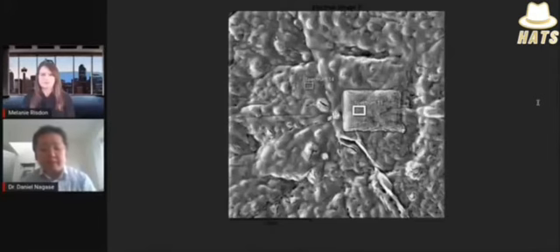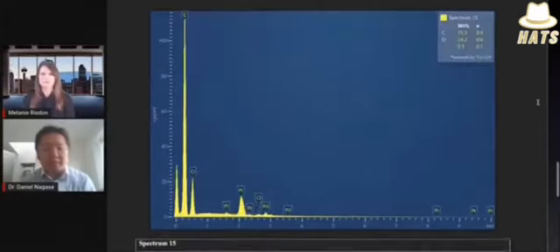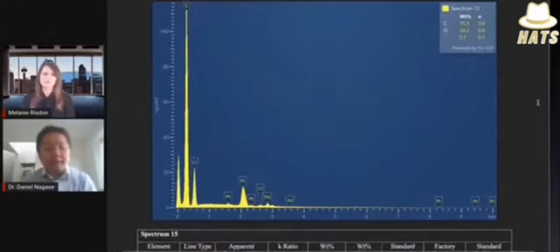Now we'll get to the thing that looks like a little computer chip with all sorts of dots in it. And that's where we have carbon and oxygen again, platinum, palladium, and a little bit of chloride. It looks like a computer chip, but it's made completely of carbon and oxygen and an unknown number of hydrogens. So again, this is not anything that I'm aware of, but it certainly isn't made of any silicon that all the computer chips we know of are made of.